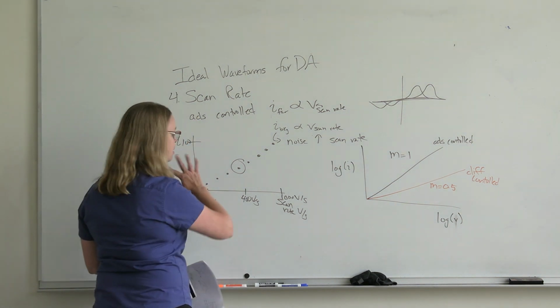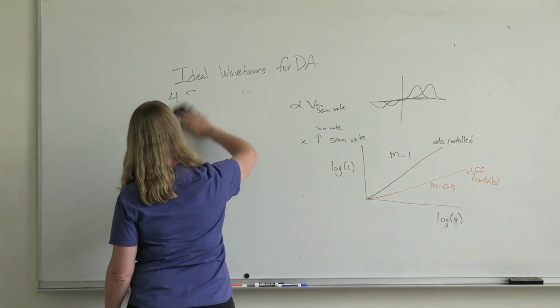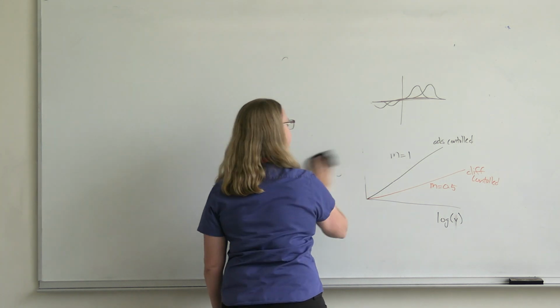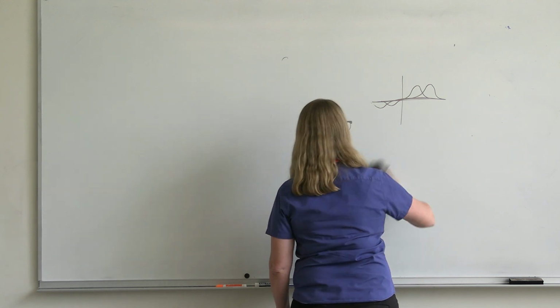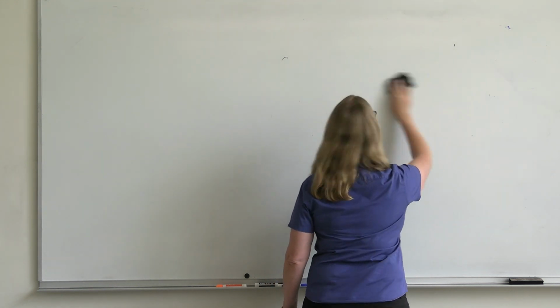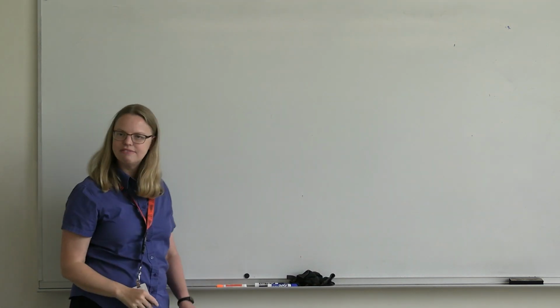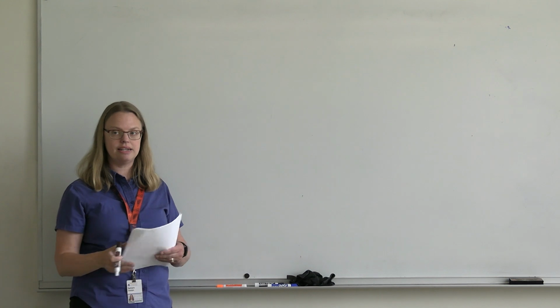Okay, so that was waveforms and shape. I'm going to do one quick last thing, and that is that the CV is not the end-all be-all in FSCV. So we don't just collect one CV, although we've spent a heck of a lot of time looking at one CV, right? We're going to do this again and again and again, and so we collect a lot of data points.